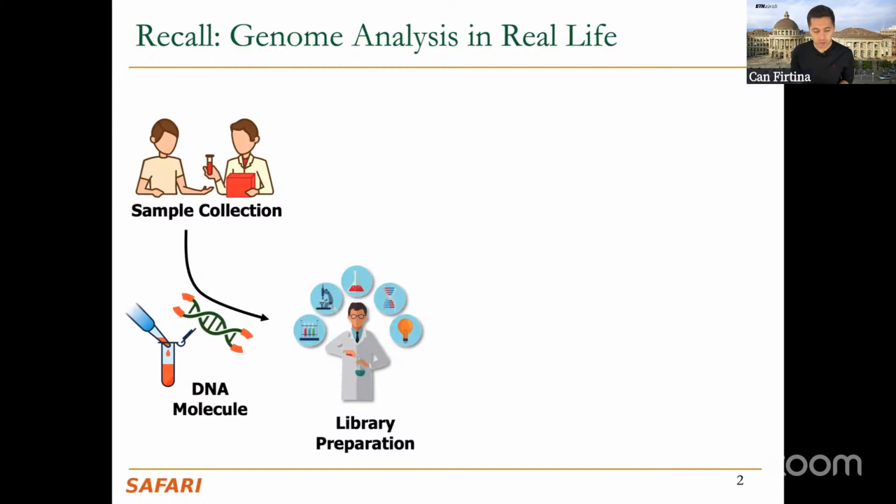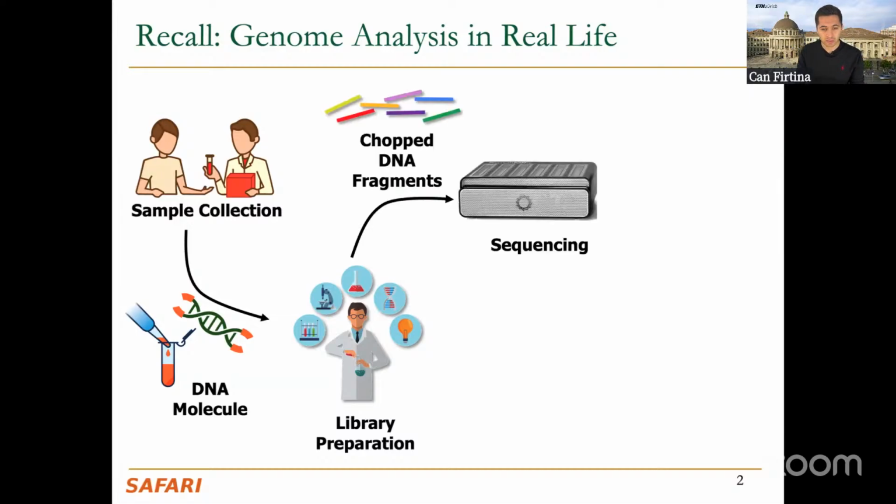The library is an intermediate step so that DNA can be sequenced in DNA sequencing machines, so that they can connect to the corresponding parts in the DNA sequencers and these machines can start reading the DNA. This is a necessary step, perhaps for now, for the sequencing machines.